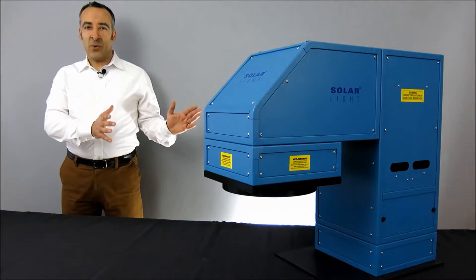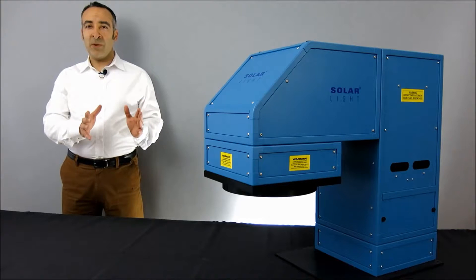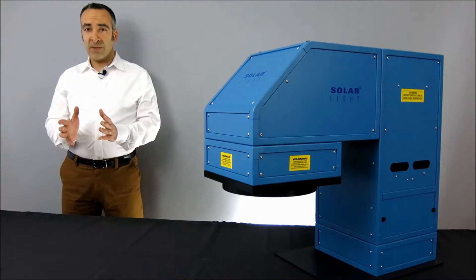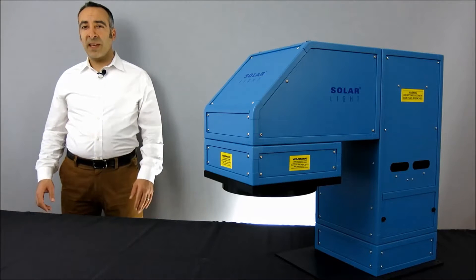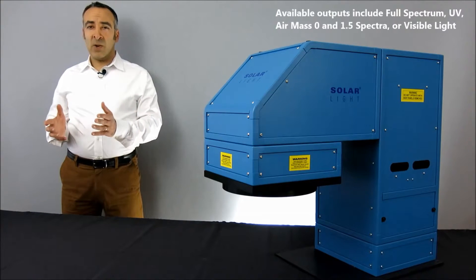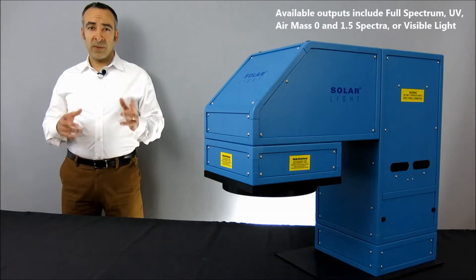These 1000-watt solar simulators all use premium-quality, ozone-free xenon arc lamps to produce 4 or 6 inch beams depending on the application. Outputs are available in full-spectrum, UV, air mass 0 and 1.5 spectra, or visible light configurations.